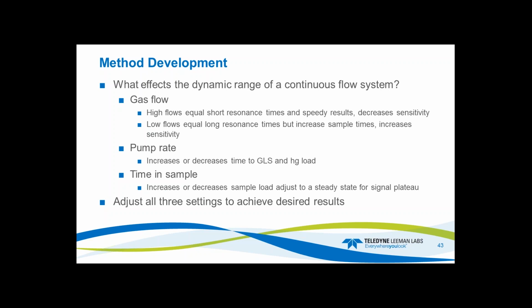Pump rate will increase or decrease time to the GLS and the mercury load. Time in sample increases or decreases the sample load. Adjust to hit the steady state for a signal plateau. So if you adjust all three of the settings, you can achieve your desired results.